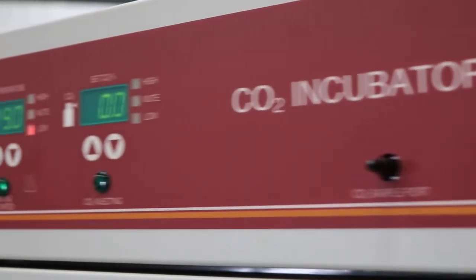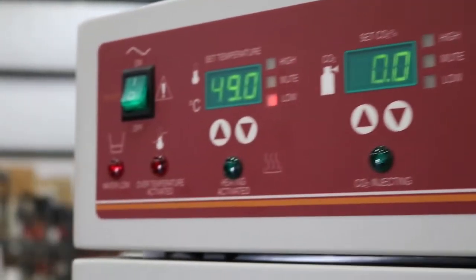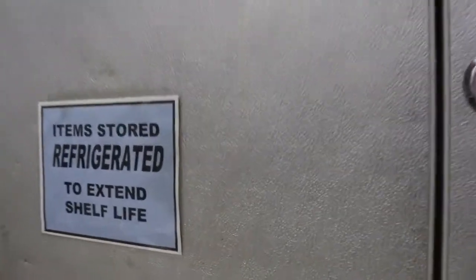The Spin Doctor is designed to operate inside high humidity CO2 incubators up to 40 degrees Celsius, or cold rooms down to 0 degrees Celsius.